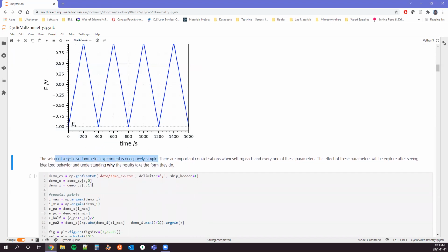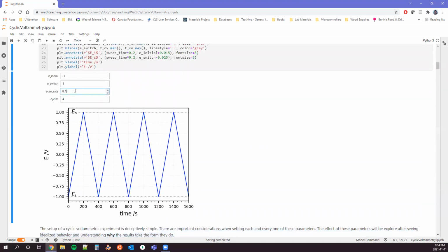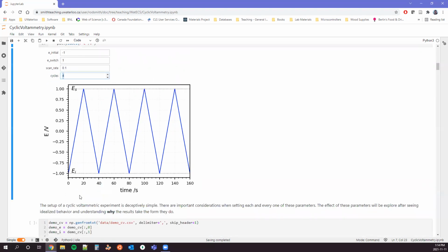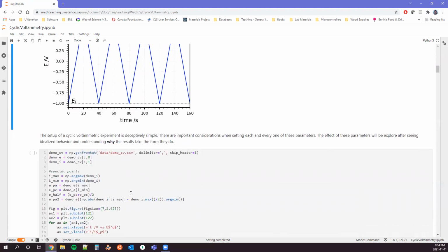So as I alluded to earlier, this is deceptively simple, right? It's really easy to go in and just start getting data. But there's a lot of considerations that go into it, and there's a lot of iterative experimentation in order to get to the results that you're looking for. And so in order to understand some of this, you need to be able to make judgment calls, right? And so you might want to start your experiment with, you know, a nice fast scan rate, just a couple of scans, see where things tend to pop up, and then start zooming in and looking more carefully, right? So starting to play around with the boundaries of your window, starting to play around with your scan rates. And you do that based on your analysis of what you see in those initial experiments.